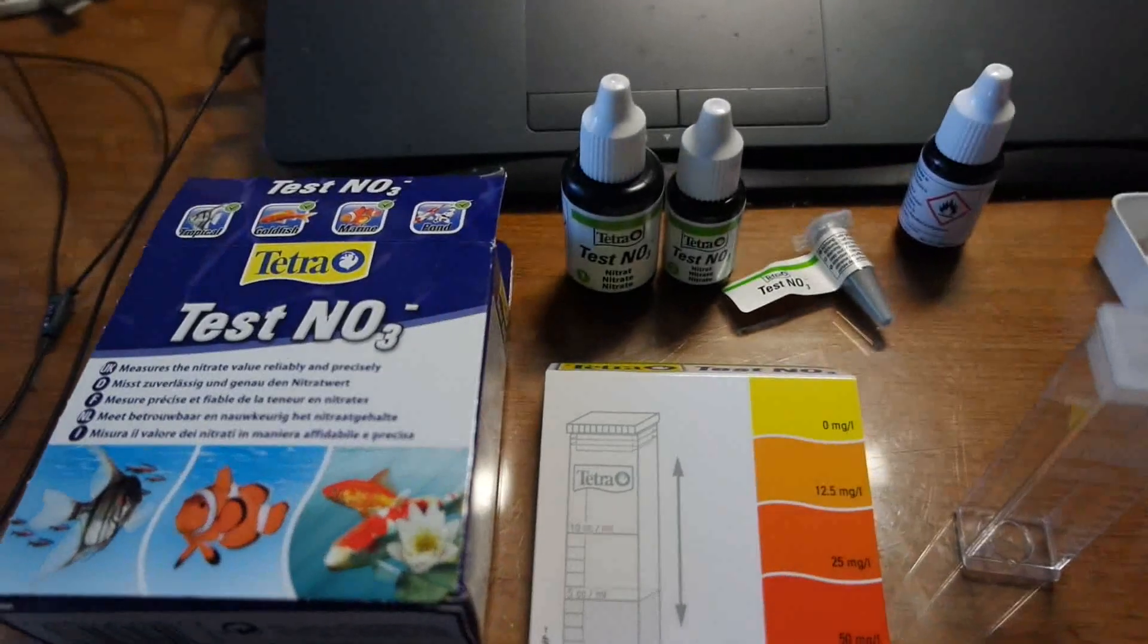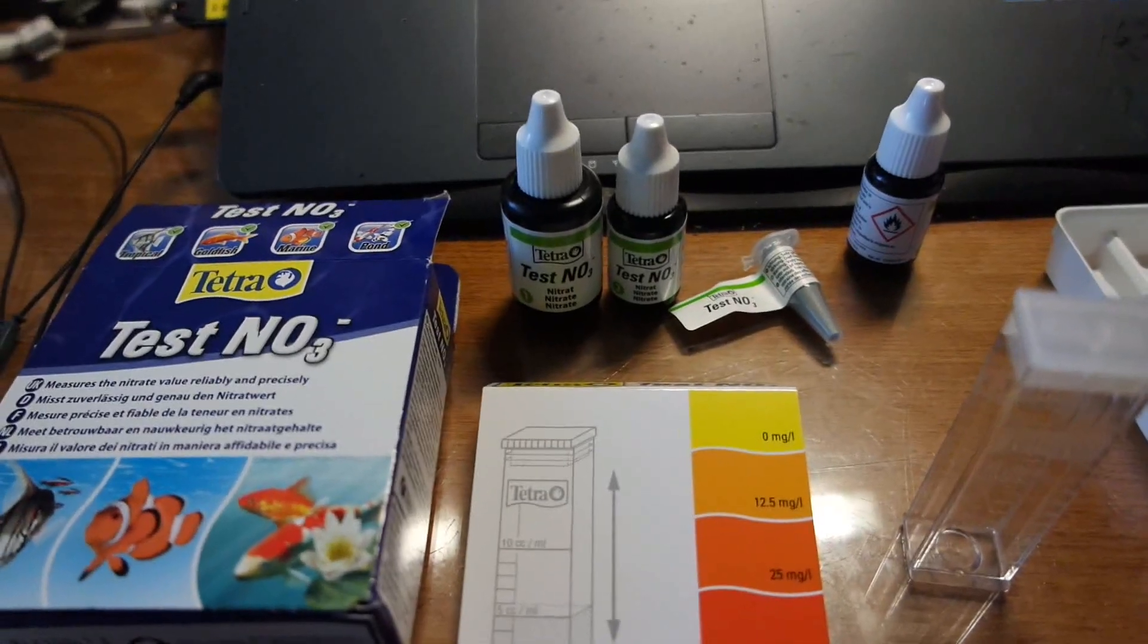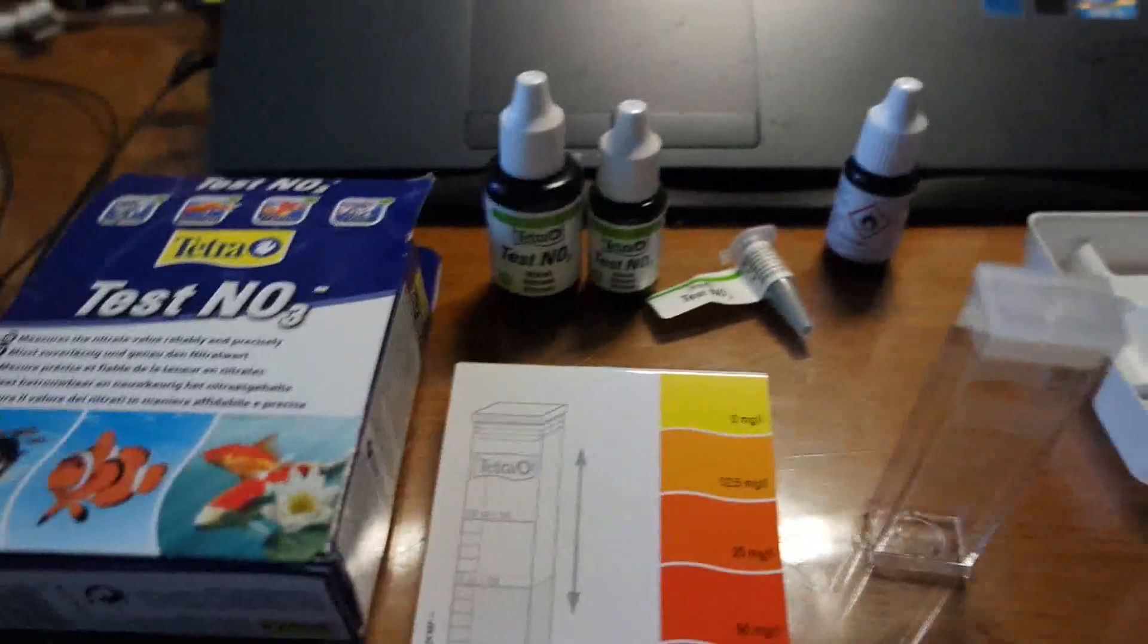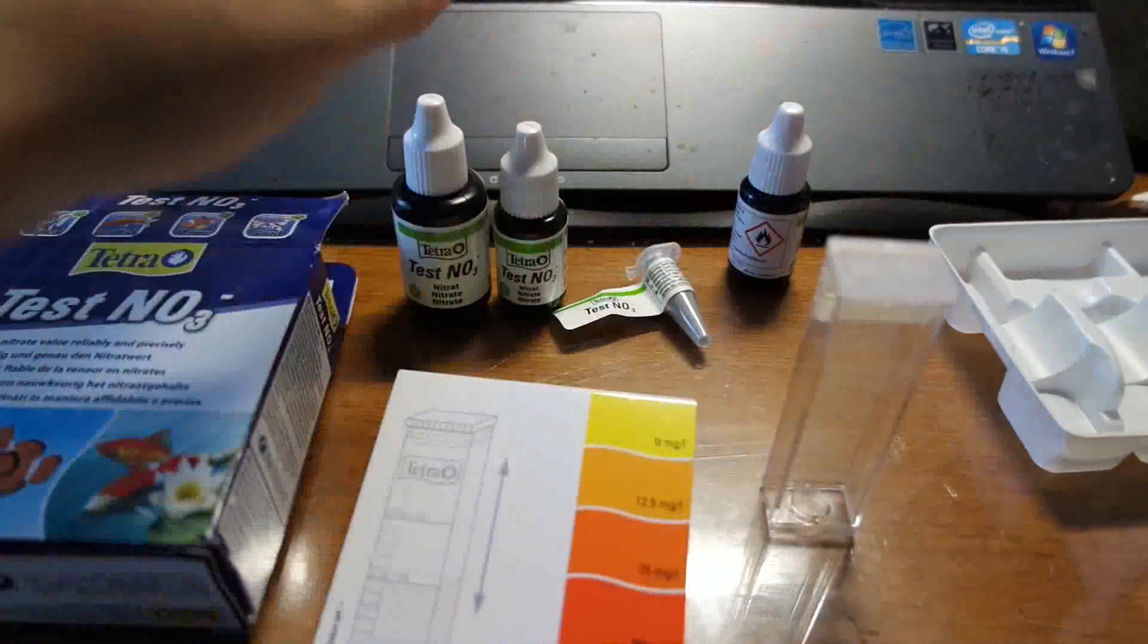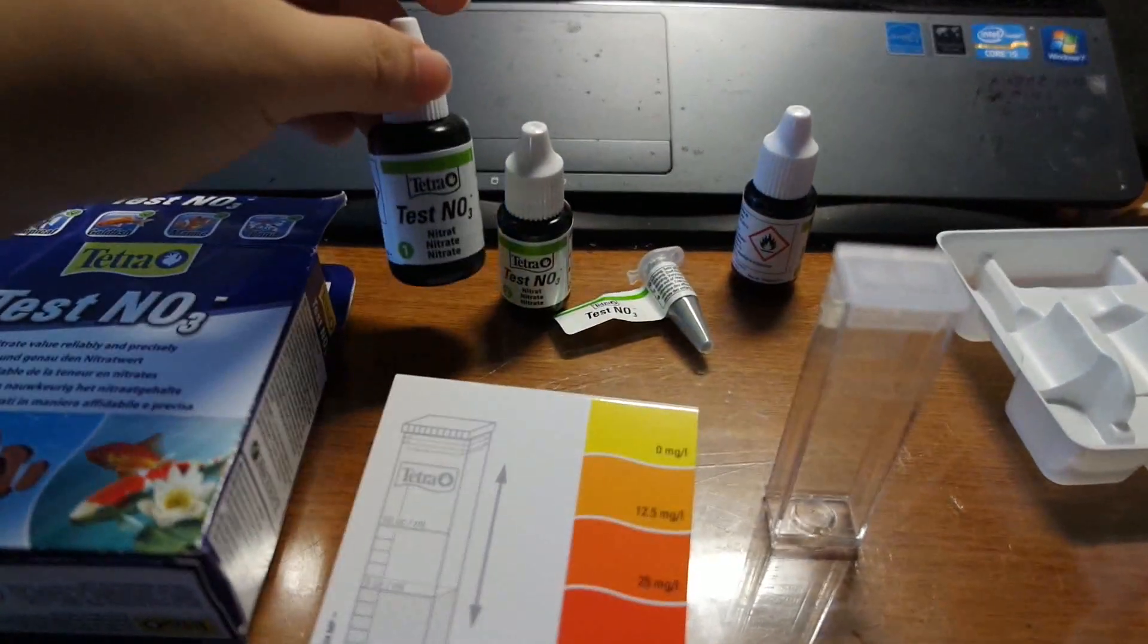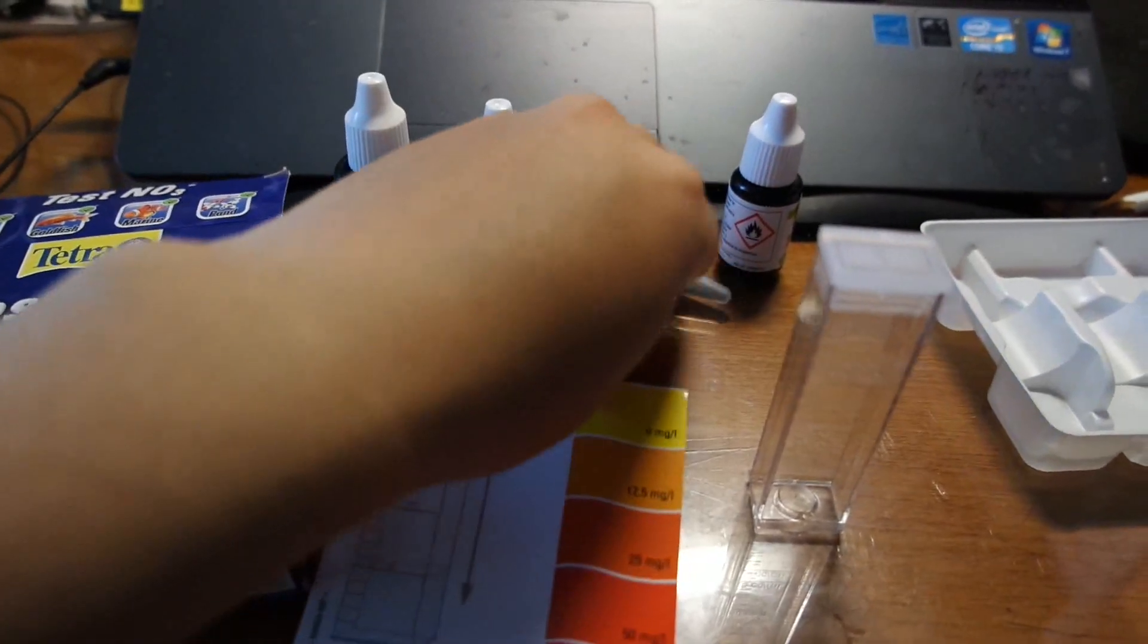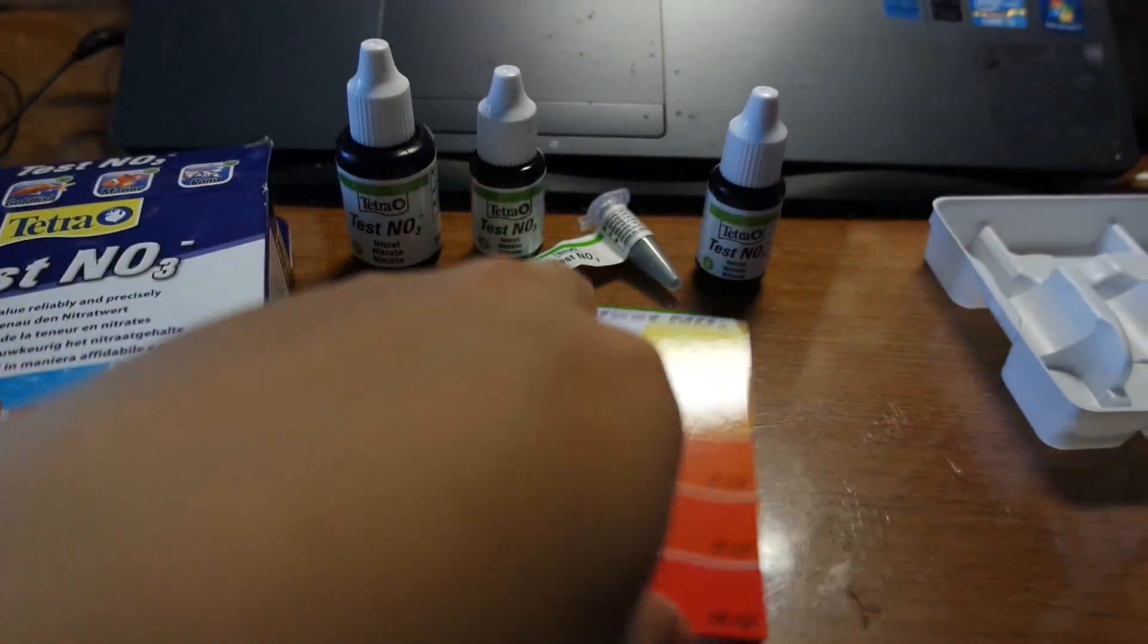For the test I'll be using the Tetra test kits. These utilize a couple of different solutions and give you a color rating as to the nitrate levels. You take some tank water and get it into this container. You add 14 drops of solution 1, then 7 drops of solution 2, then a tiny bit of powder, and finally wrap it up with 7 drops of solution 3. You shake it and then you get a color. Dark red means bad and yellow means good.